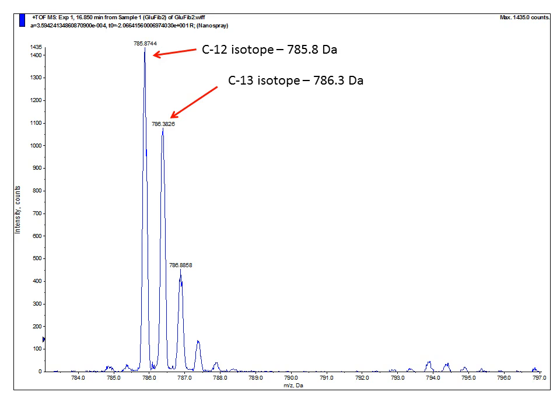Before we go on, we'll have a quick review of how the mass spectrometer generates data. The MS continuously scans a mass range, typically 350 to 1500 Daltons when using electrospray, and it does this for about half a second per scan. If interfaced with chromatography, sometimes there are no ions in the scan of the spectra. But depending on the complexity of the peptide digest injected onto the column, there could be 1 ion or 20 to 30 ions in a scan.